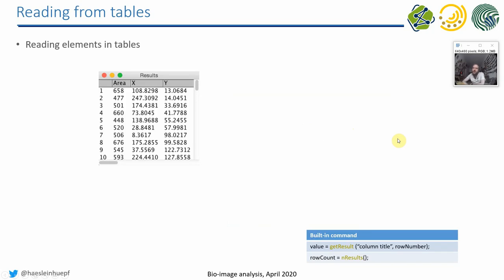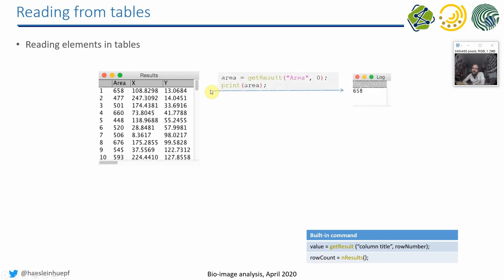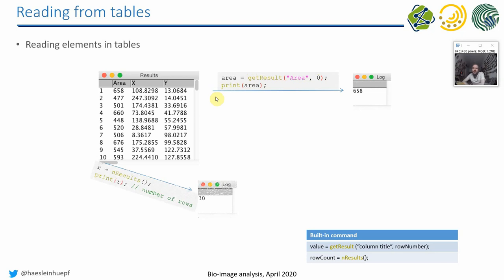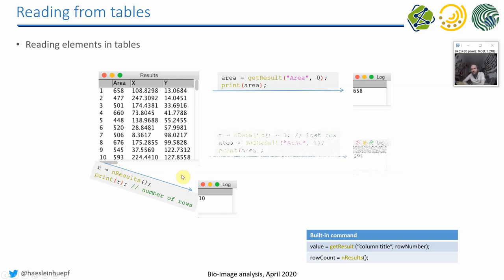So if you now want to, for example, read out the table line by line and do a calculation of your own particular shape descriptor, for example, you can do it like that. There is in macro, there is the so-called get result method, where you hand over the column you would like to read and the line number. And like with arrays, also the line number starts with zero. The last line, or actually the number of lines in your table, you can read out by calling the nResults method. And if you want to access the last line of your table, it's nResults minus one. Because again, if you have five rows, these five rows are 0, 1, 2, 3, 4, not 5.